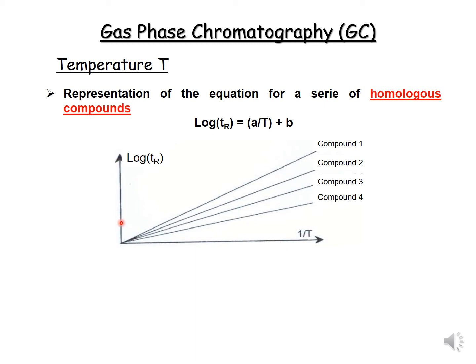So here you have the log of TR, which represents the retention time, and if I go in this direction, the retention time increases. And here I represent 1 over the temperature.